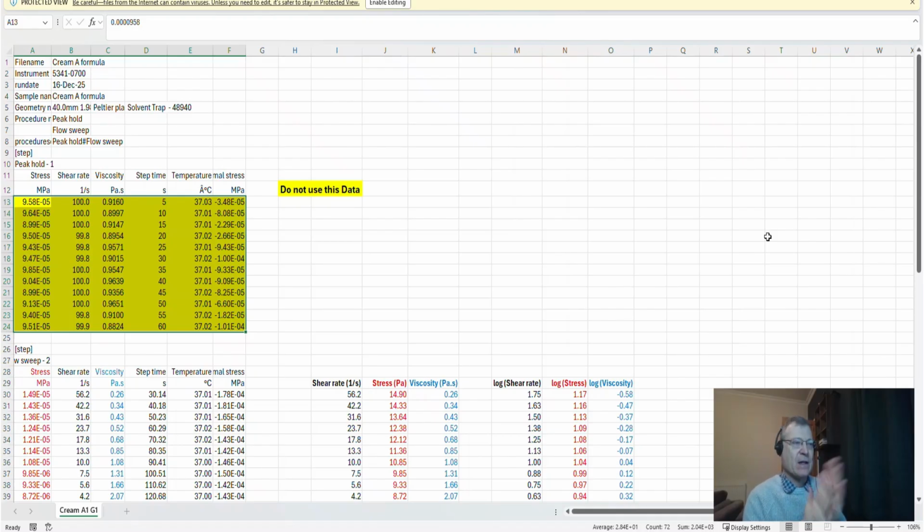And the reason for that is that it creates a very nice uniform response from the instrument that's very reproducible, and it makes the data much easier to interpret and more straightforward for you at this point. Now, as you move on with this journey in rheology, that won't be the case, and we won't do that pre-treatment, because actually measuring that as it goes onto the instrument is really important, and there's lots of valuable information there.